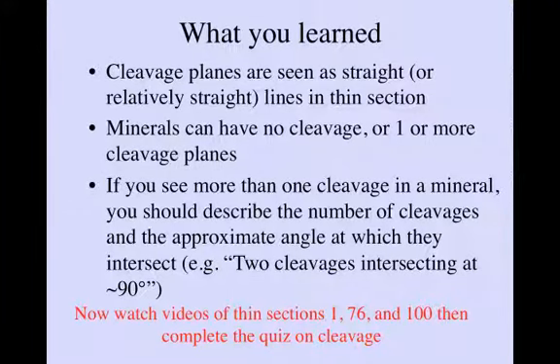Now I'd like you to watch videos of thin sections 1, 76, and 100 and complete the quiz on cleavage.